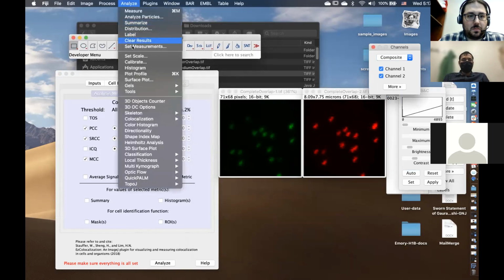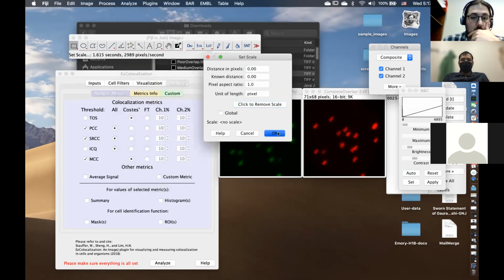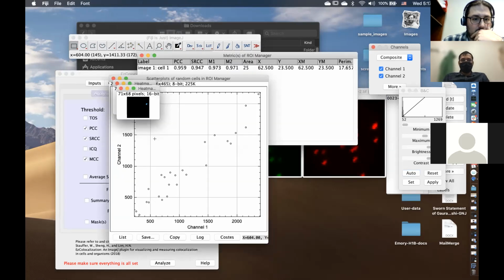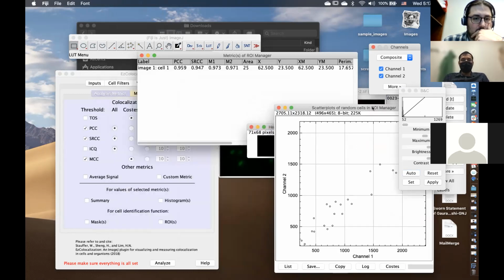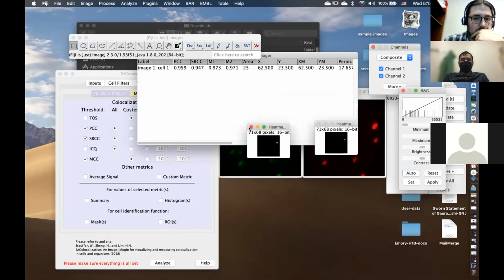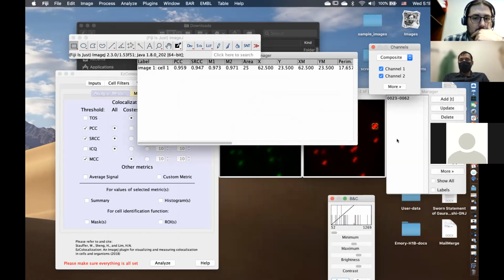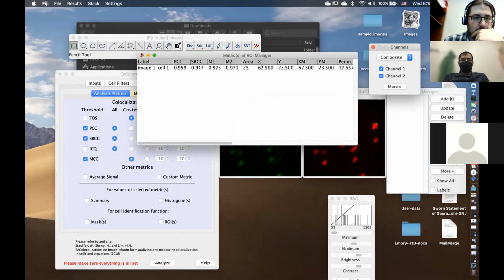I don't know if this is just me who is having these issues. Okay, so I removed that, and then once I hit analyze, it worked out fine. But again, this is for one region of interest and not for the entire image. So now if I go back and delete the ROI, and try to analyze the same thing for this data set.